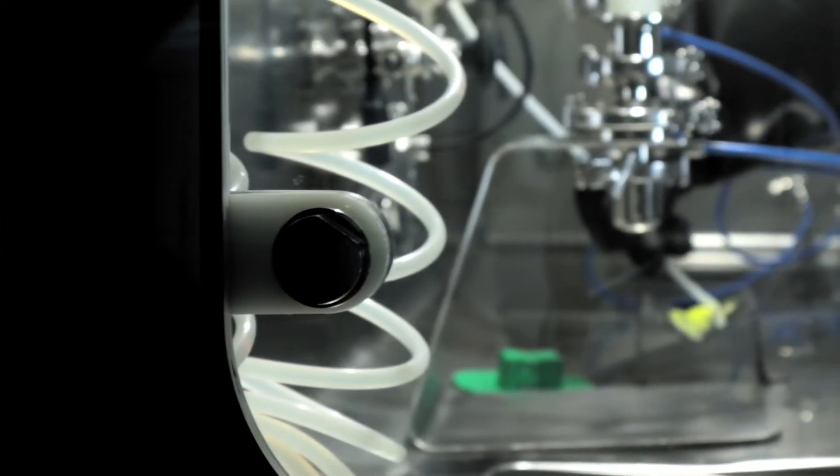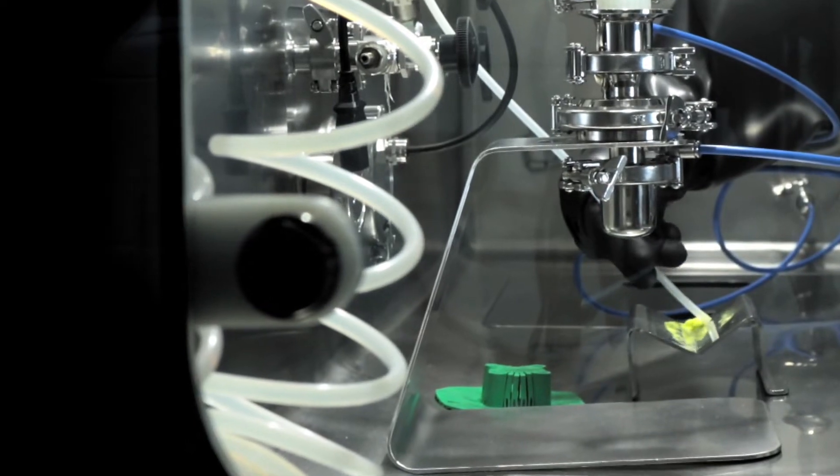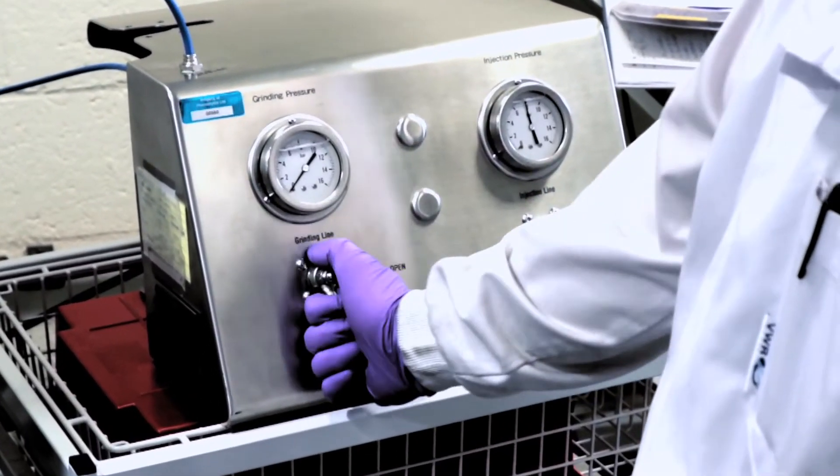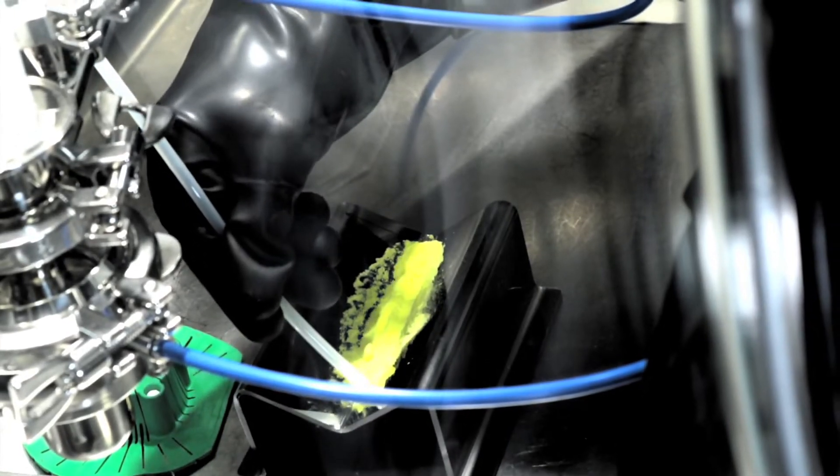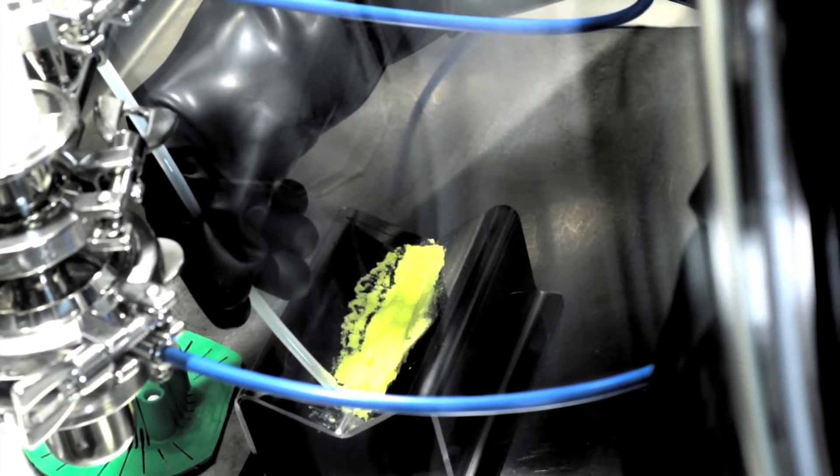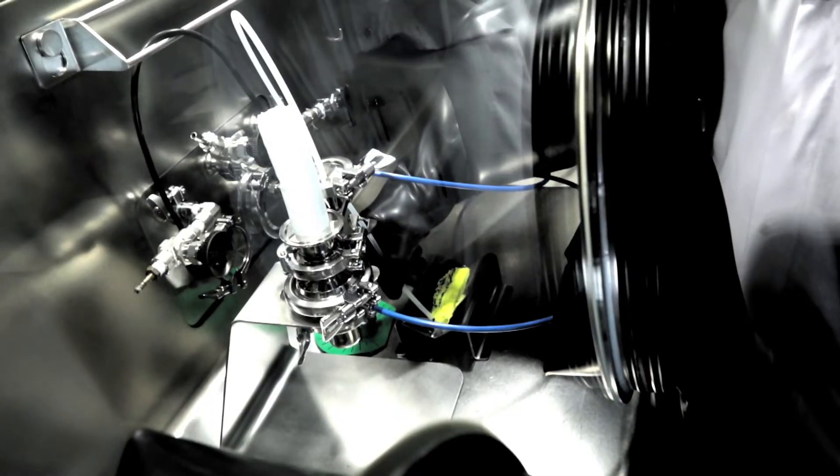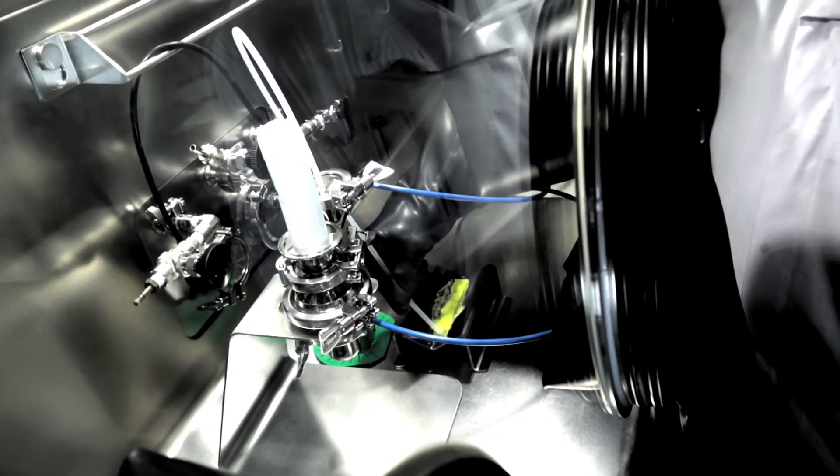Milling operations are known to generate fine dusts, which are an explosive hazard, so we operate inside an inert atmosphere in an isolator. This also reduces material degradation and eliminates personal exposure to potent materials.